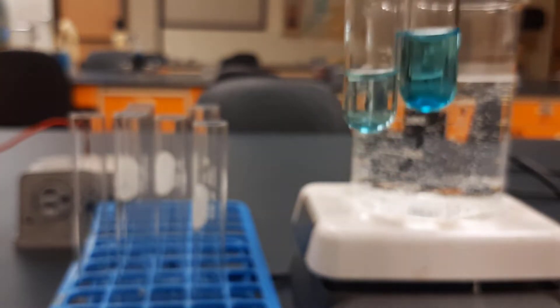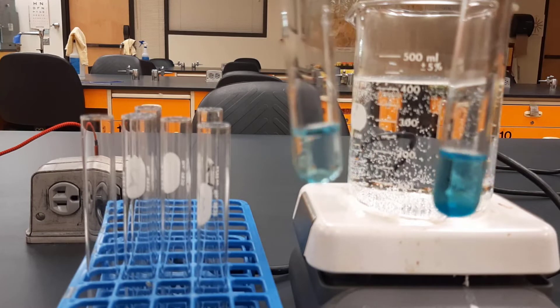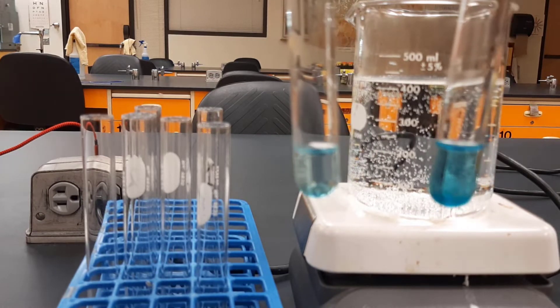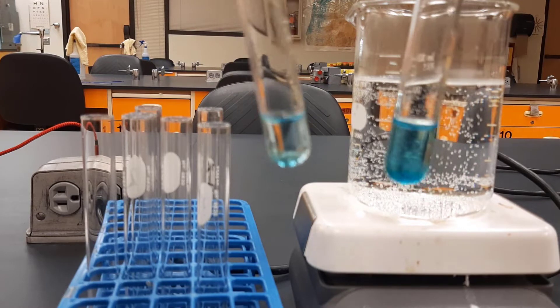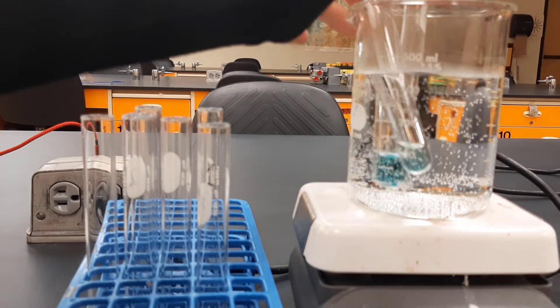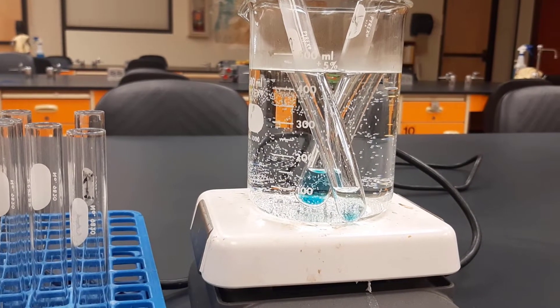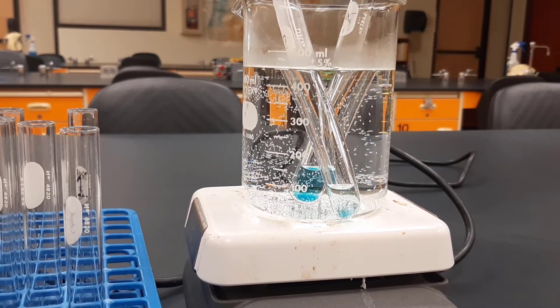For this test we have to heat it. We heat the reagent, and it will change color if it is positive for a reducing sugar. The darker the color is, the more of that sugar is present. So let's put them in and we will speed this up and come back once it's heated.